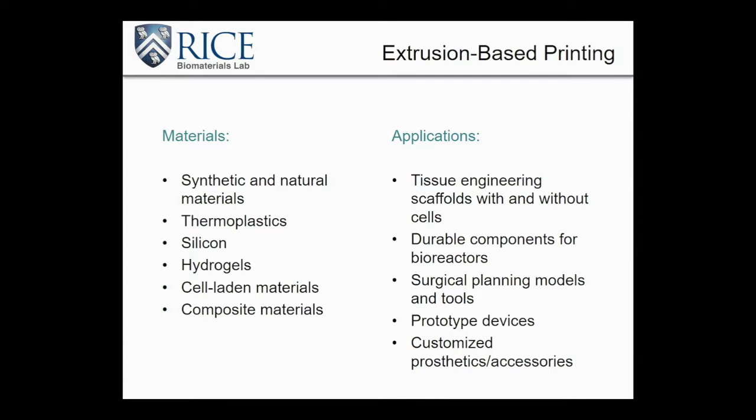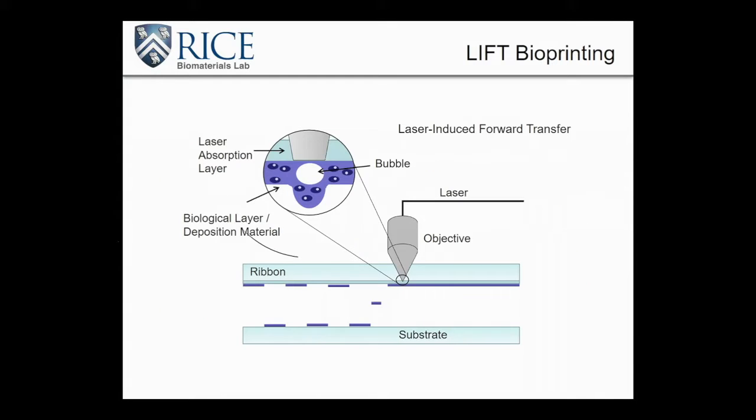And if you're using high temperature techniques such as fused deposition modeling, it's going to be very difficult to incorporate cells, growth factors, or other bioactive substances, although there are some workarounds that, again, we're going to talk about later that I think are very interesting. And finally, the solidification rate varies drastically. You saw some of the issues too with if we don't get the right process parameters, we don't get the right structural integrity. So I'm not going to belabor all the different materials we can use. Like I said, through applications, we can go everything from surgical pre-planning and tools all the way to tissue scaffolds as complex as we want.